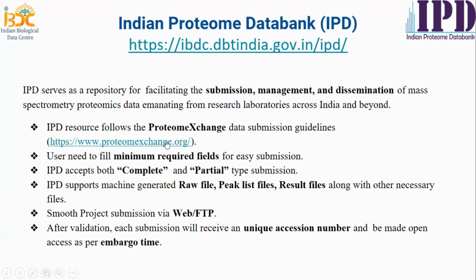You can check this link, and all users need to fill the minimum required fields for easy submission. IPD also provides complete and partial submission types that I will discuss in the following PPT. It also supports machine-generated raw files, peak list files, result files, along with the other necessary files.